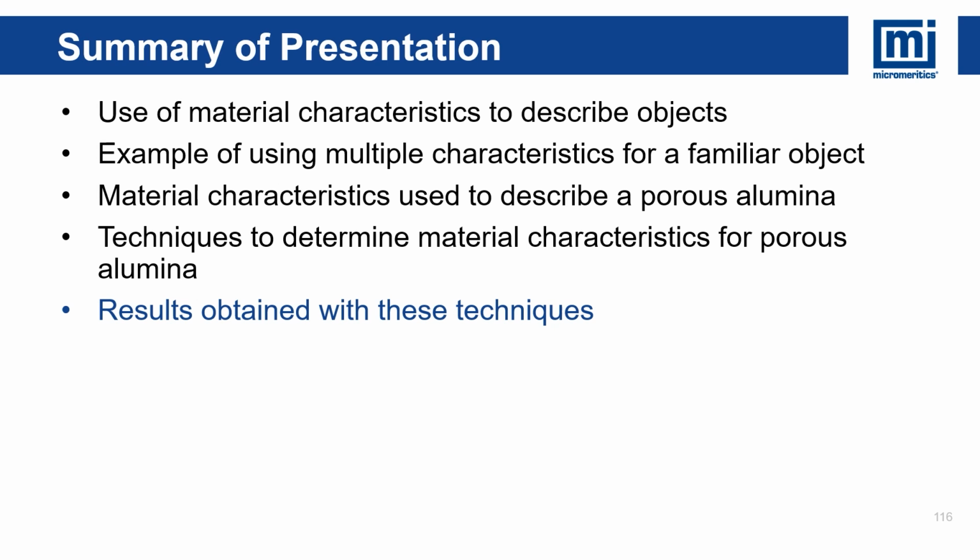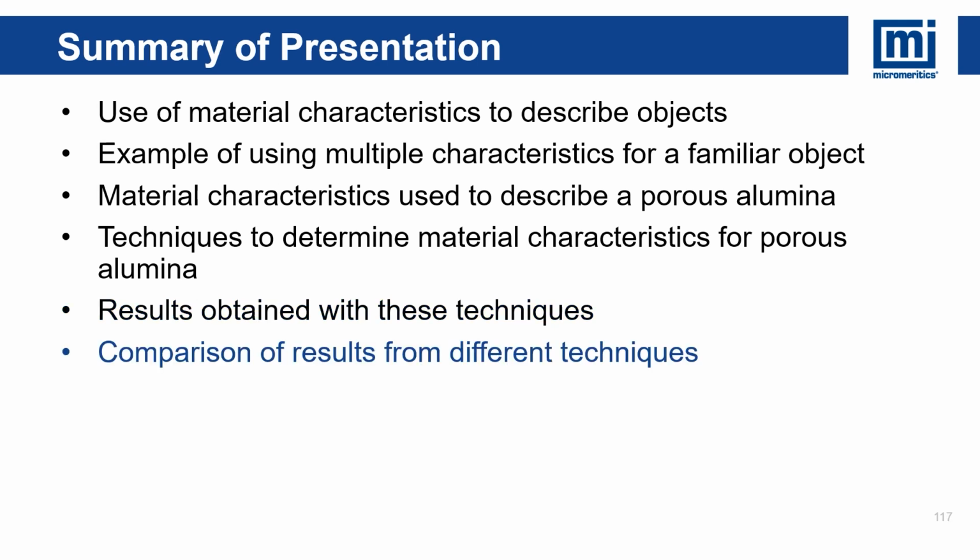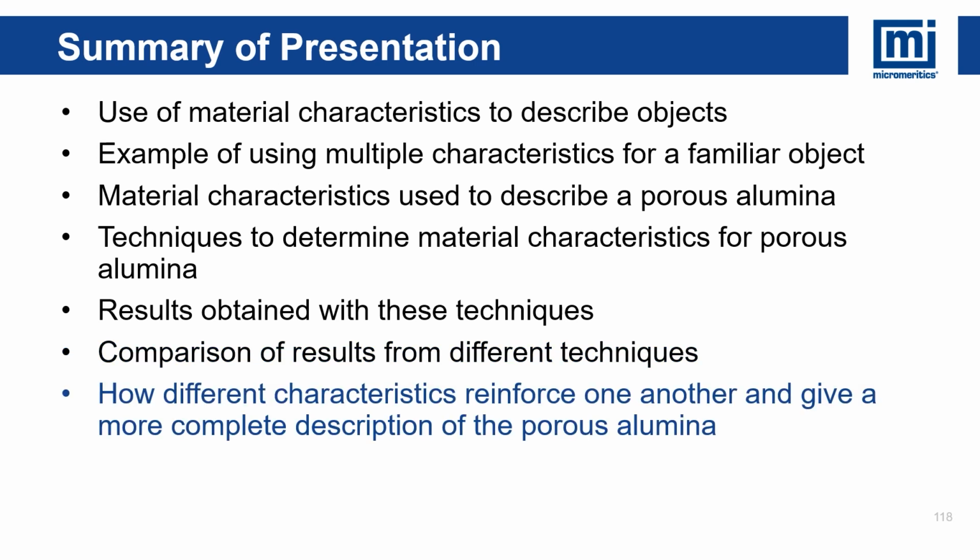We then discussed ways in which the techniques can support one another. They can corroborate results, and they can help improve results by providing additional calibration information and additional adjustments for things like contact angle and conversion factor for the dry powder displacement method.